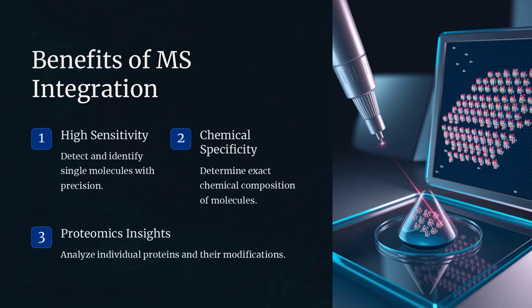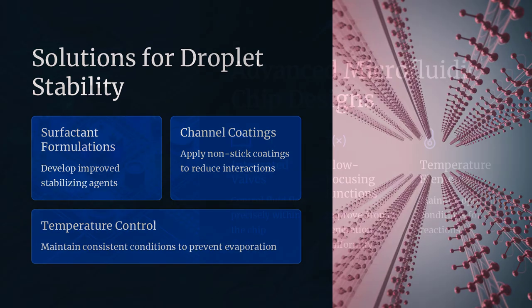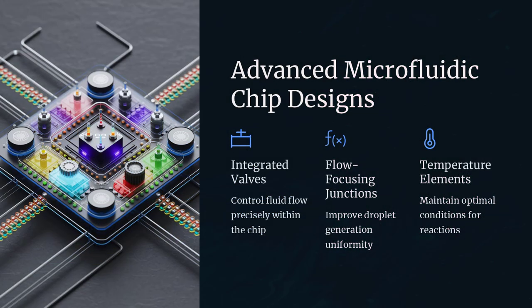A thought-provoking question is, how do researchers deal with the enormous amounts of data generated by single molecule experiments in microdroplets? The answer lies in advanced data analysis algorithms and machine learning techniques. High-throughput microdroplet experiments can generate terabytes of data, as each droplet's time series fluorescence or current trace must be analyzed to identify individual molecular events. Researchers employ automated data processing pipelines that use statistical methods and machine learning to sift through the noise and extract meaningful signals. These computational tools not only speed up the analysis, but also help in identifying subtle patterns and correlations that might be overlooked by manual inspection.